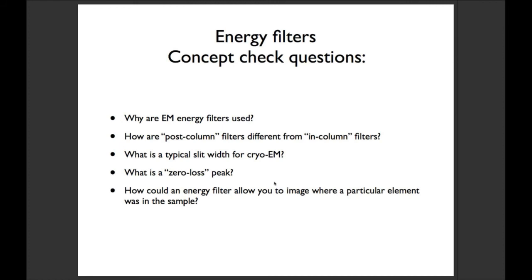Producing an image using electrons that lost a certain amount of energy. So that's what you can use and it's part of EELS, electron energy loss spectroscopy. But I don't think people buy an energy filter to do materials type experiments like that, but they could. Yeah, a problem we have with our Krios, we would not be able to do EELS because our beam is not really so bright.